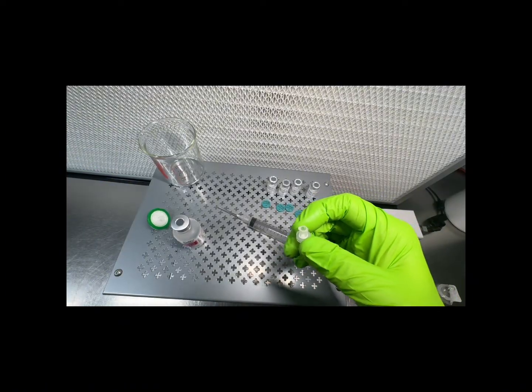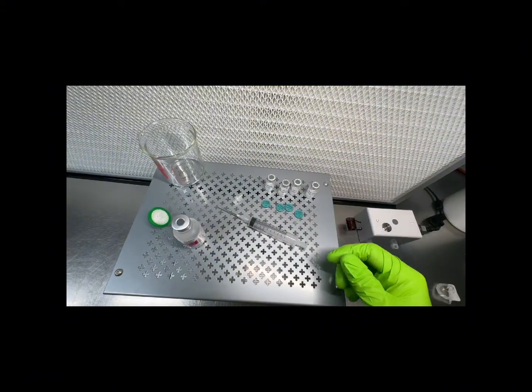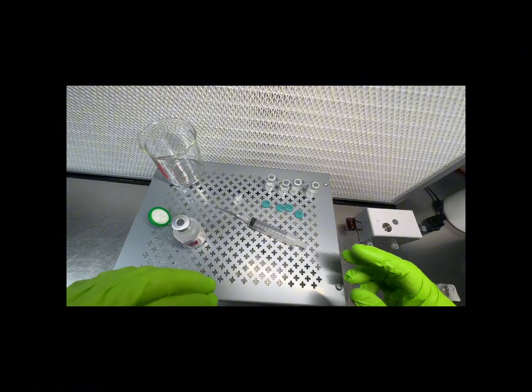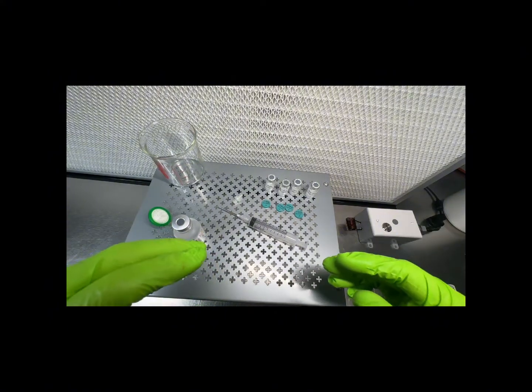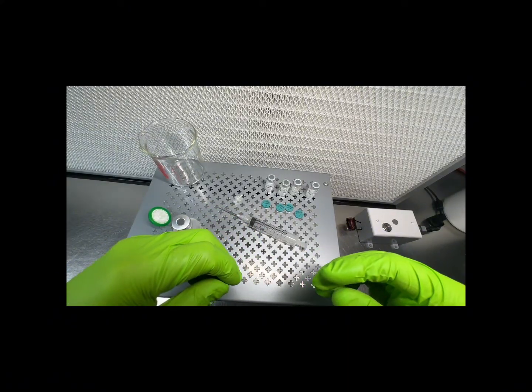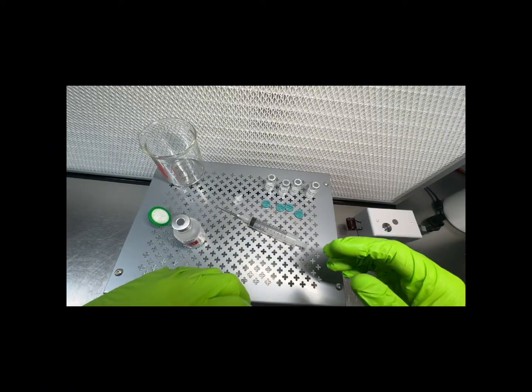So one of the things we've been wondering is how much peptide will go through a filter before it clogs. The way these filters work, even though the size of a peptide is smaller than the pores in this, essentially what happens is it's almost like hair in a shower drain. At first, it will go through, but eventually it starts clumping together and builds up, and then the clumps start clogging whatever the medium is.